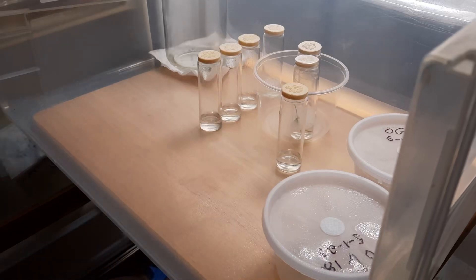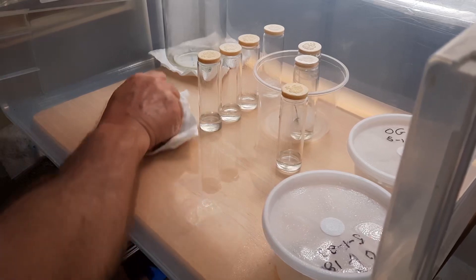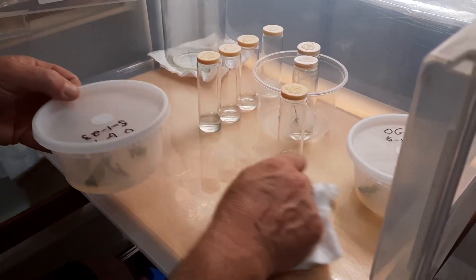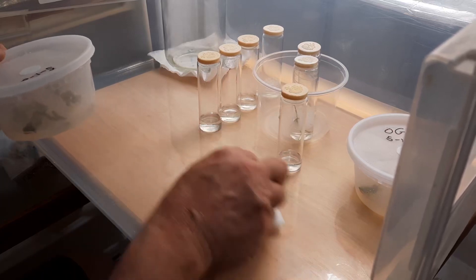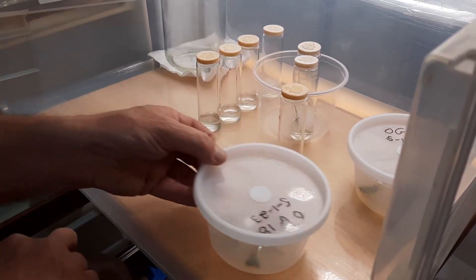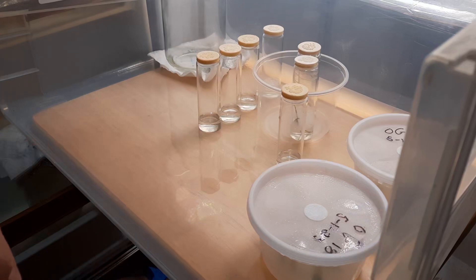Plant tissue culture is different in the fact that you use different hormones to manipulate the growth of your plants. Sometimes you just want them to grow root mass. Sometimes you want them to grow tons of branches, making miniature mother plants. Sometimes you want them to grow roots so that you can transplant them into a pot.